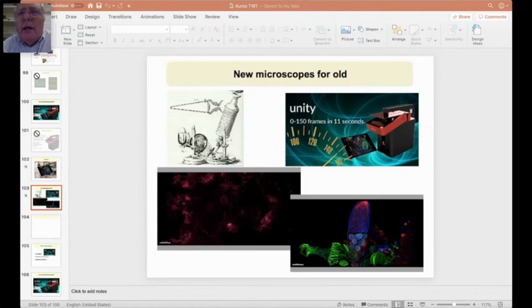They had a mirror for scanning in the relatively slow frame direction, and they had an AOD for scanning in the line direction, and that was a real-time microscope. So I'm going to guess that might have been the first commercial high-speed beam scanner. But I don't really know the answer.